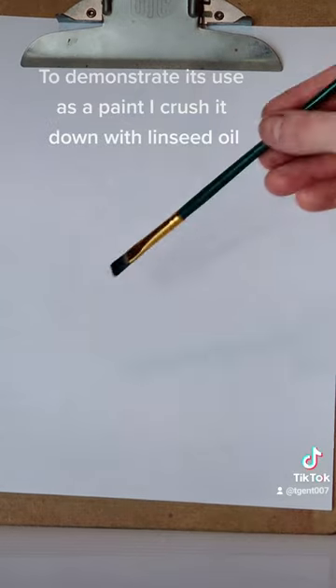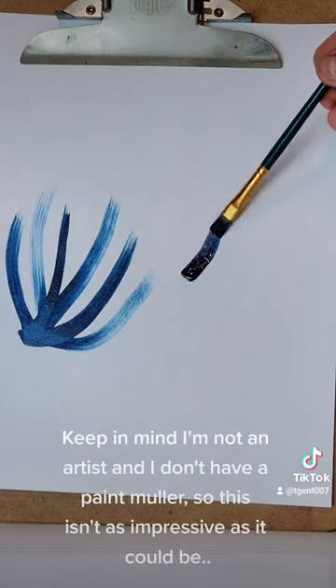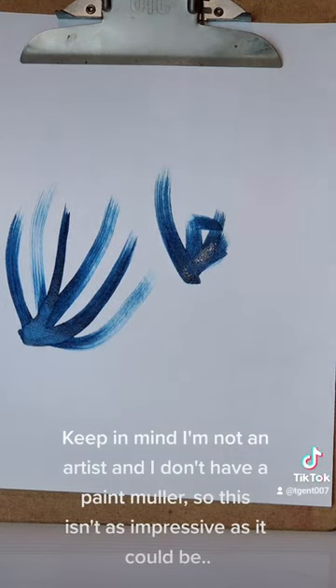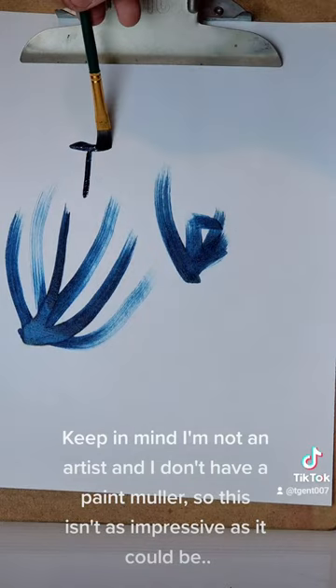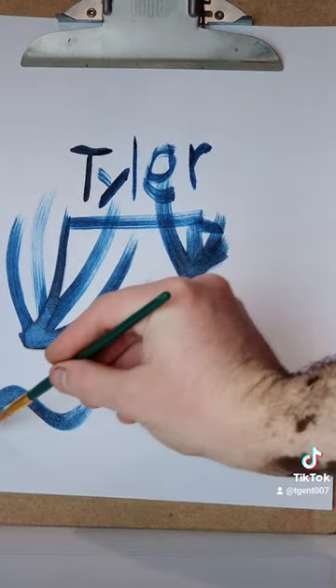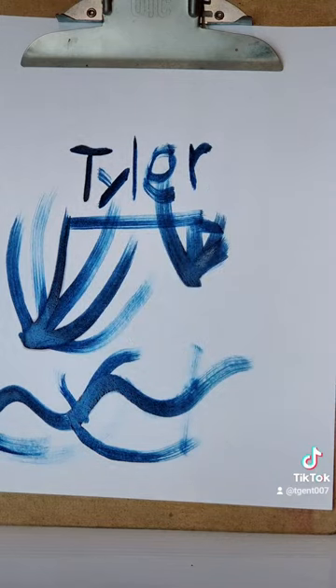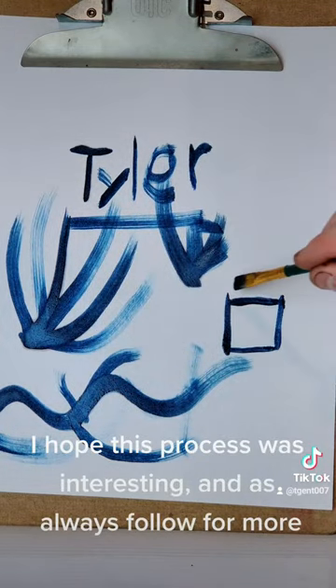To demonstrate its use as a paint I crush it down with linseed oil. Keep in mind I'm not an artist and I don't have a paint muller, so this isn't as impressive as it could be. I hope this process was interesting and as always follow for more.